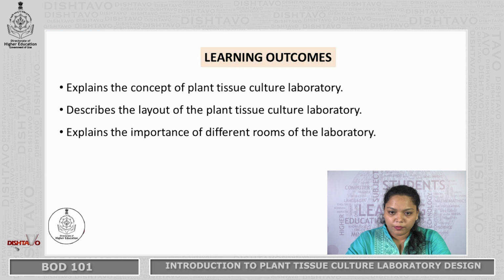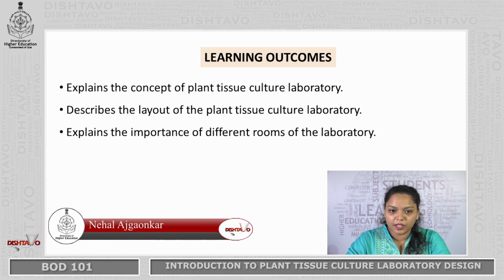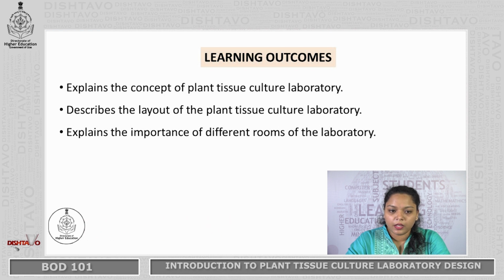The learning outcomes of my module will be: this module will explain the concept of plant tissue culture laboratory. It will describe the layout of the plant tissue culture laboratory, and it will also explain the importance of different rooms which are allotted in the laboratory.